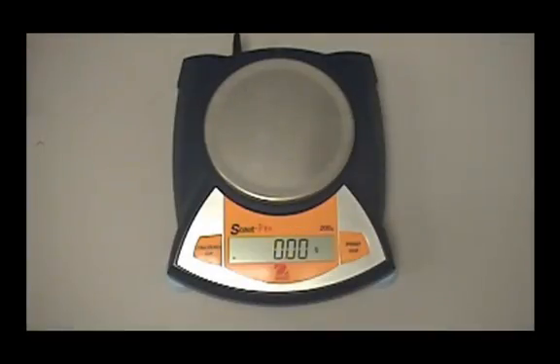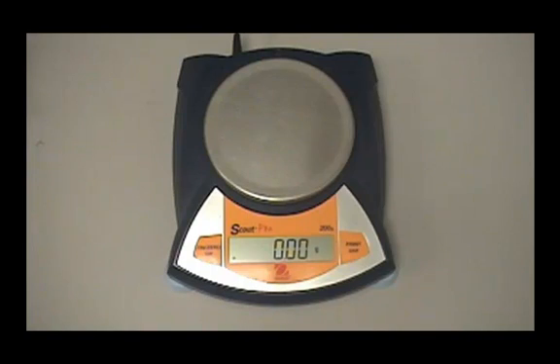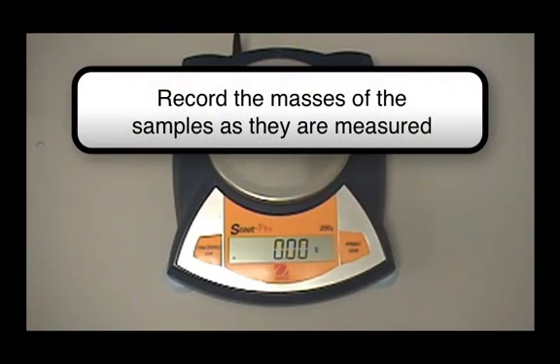Let's see how we can count by weighing materials out. We're going to count Q-tips, only we're going to count them by mass. The first thing that we need to do is determine what is the average mass of a Q-tip. Now, I'm going to go a little extreme here, and we're going to find out that average using 7 different samples of 50 Q-tips. So let's go through and measure these out.